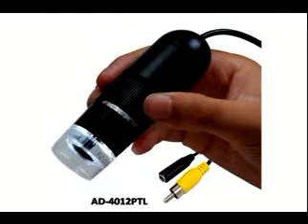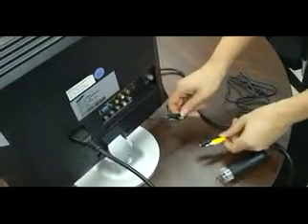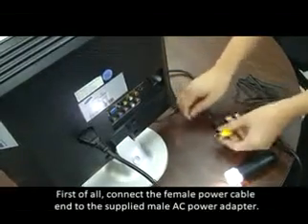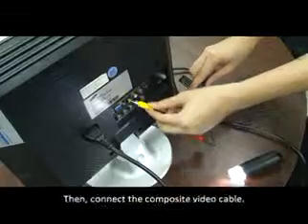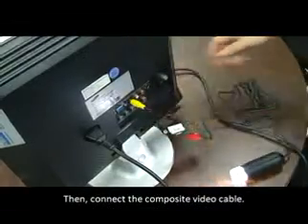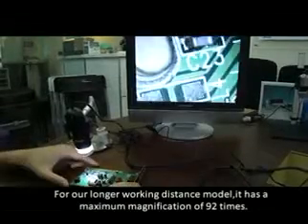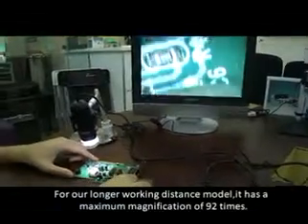The AD4012PTL model features improved color rendering and long working distance. To connect the RCA cable, first connect the female power cable into the supplied male AC power adapter, then connect the composite video cable. For this longer working distance model, it has a maximum magnification of 92 times, and you must maintain about 2.2 inches distance away from your object.